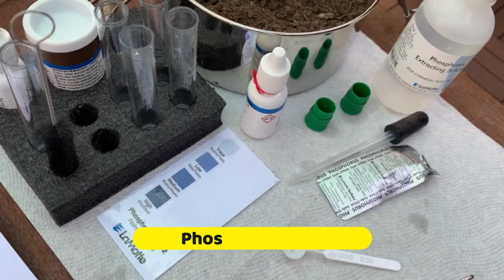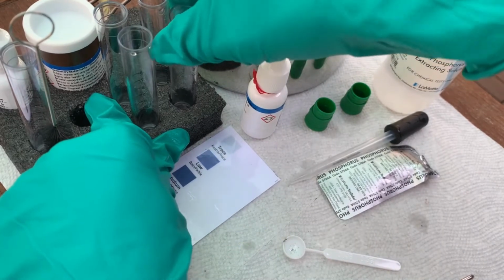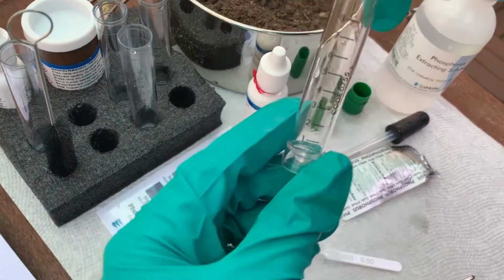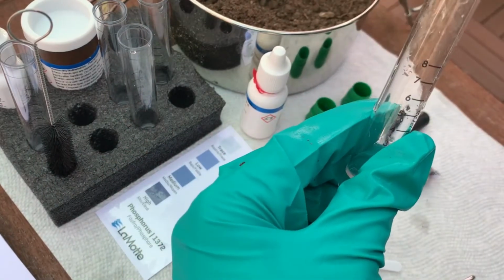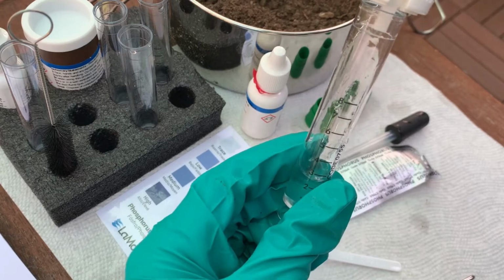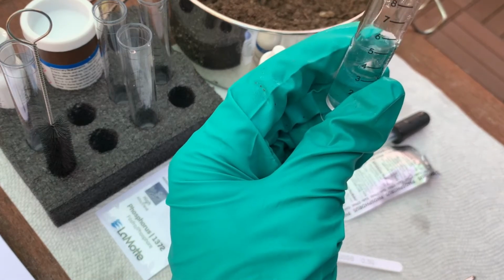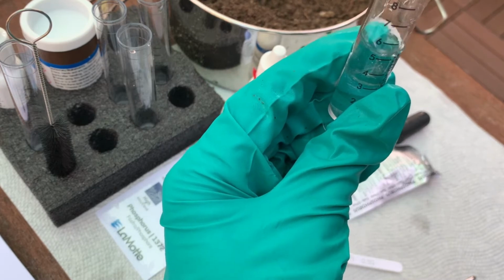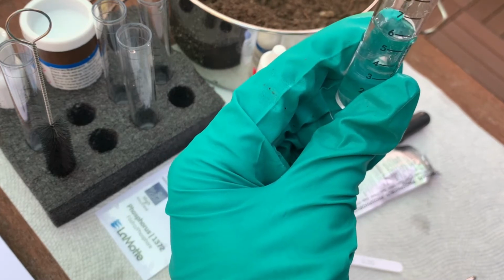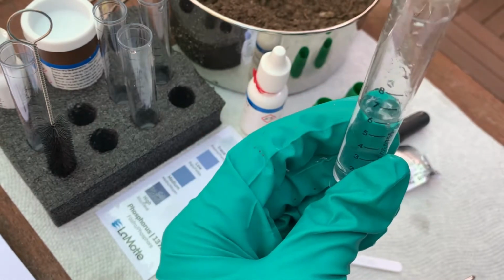Now let's do the phosphorus test. We're going to follow very similar steps, but I recommend you clean everything up and take all the things away that you don't need. So don't have nitrogen stuff sitting out. Pull out all the phosphorus materials and follow those steps without any possible distractions.